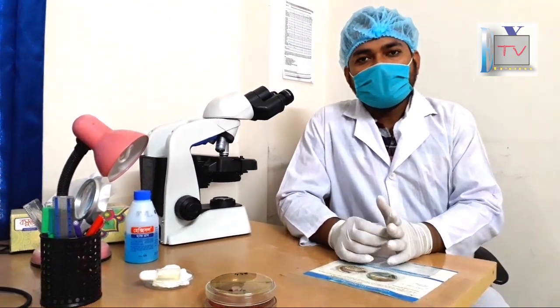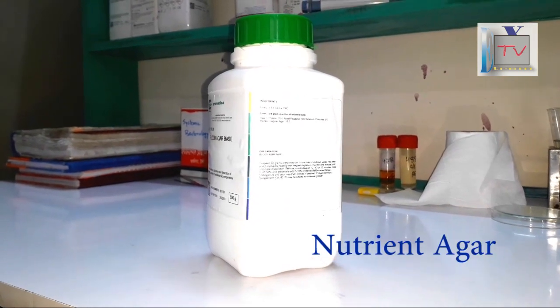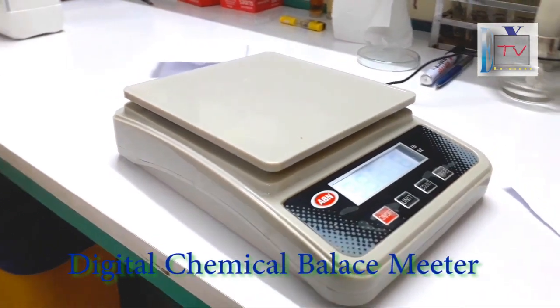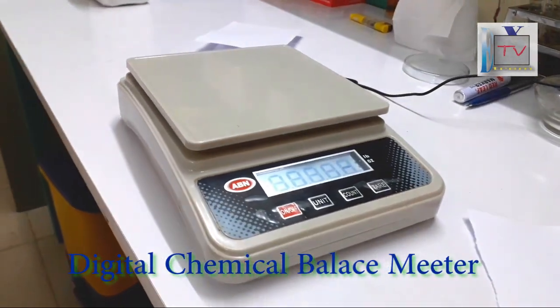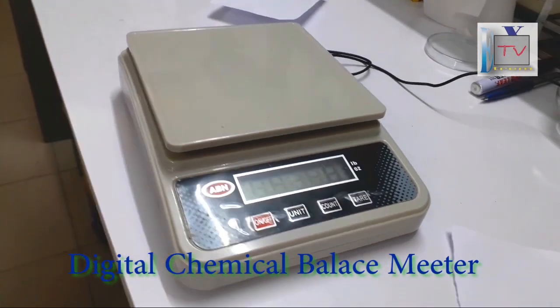This is the chemical balance. This is the digital chemical balance.